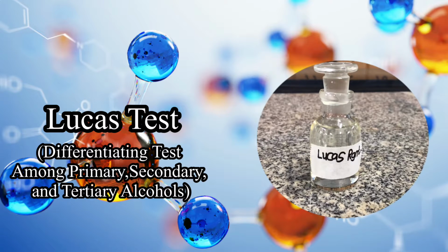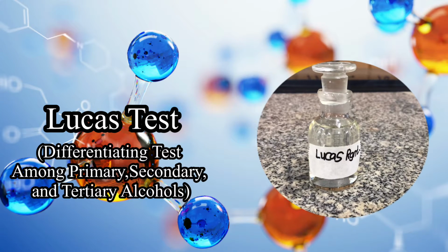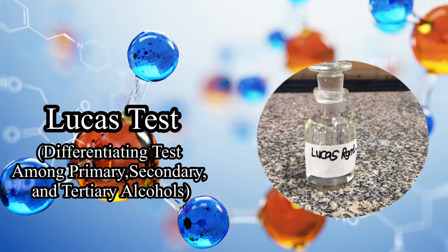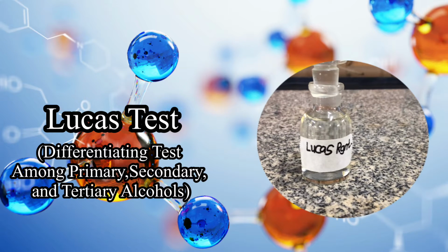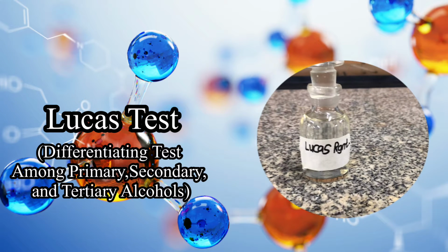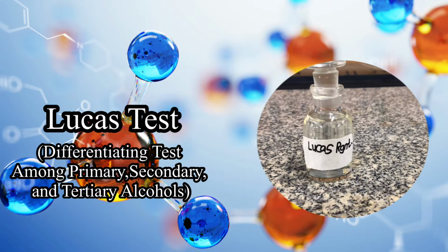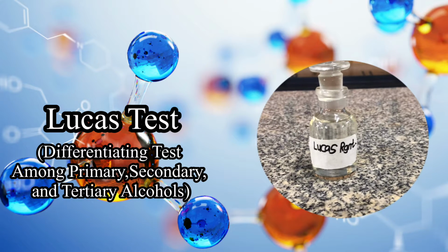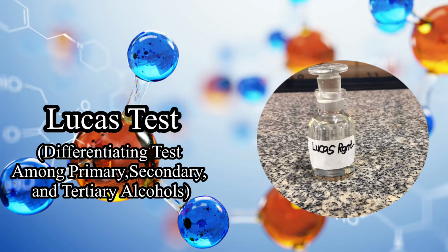The next test is the Lucas test. This is a differentiating test among primary, secondary, and tertiary alcohols. The reagent used for the test is a mixture of concentrated hydrochloric acid and zinc chloride. This is known as the Lucas reagent. The reagent converts the alcohols into alkyl chlorides.